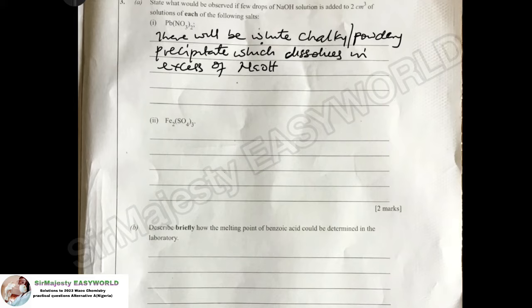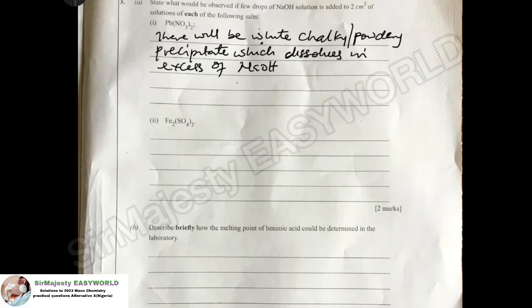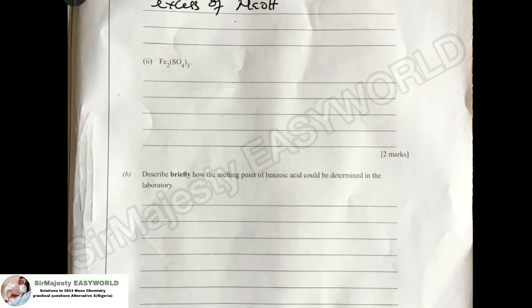They did not ask you for inference again because they have brought the anions. So students, when you teach them how to test for lead 2 ion, when they see this lead 2 trioxonitrate 5, they now think, is there another different way? No. In salt analysis, most times we are detecting the presence of cations and anions. So if they give you any salt sample, you separate it into anions and cations and then detect them. So the same thing is applicable here.